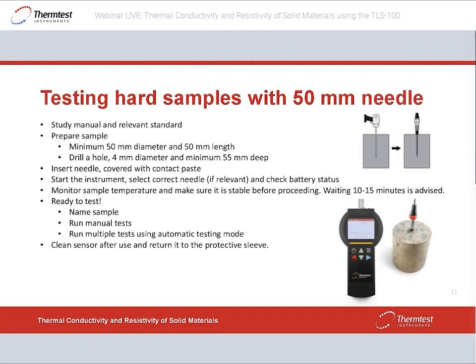And you should drill a bit further than the length of the needle, simply because you will have to use contact paste. Some of the excess contact paste might end up at the bottom of the hole and you don't get the needle all the way down, which is bad. If you have a little bit extra space, you will not run into problems with this. If you have a 50 millimeter long sample, drill through it so you can push out the extra contact paste.